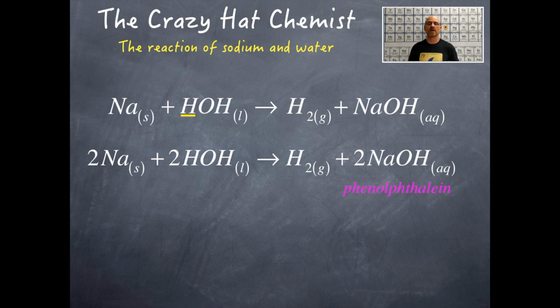The upper layer was mineral oil. And of course, that's why the sodium just kind of floated in the mineral oil a little bit and then fell through the mineral oil because the sodium was more dense than the mineral oil, and water is more dense than the mineral oil. So the sodium reacted. Once it hit the water, then it reacted with the water, produced bubbles. Those bubbles were hydrogen gas, and you could actually observe those bubbles in the graduated cylinder that were rising up in the oil layer.